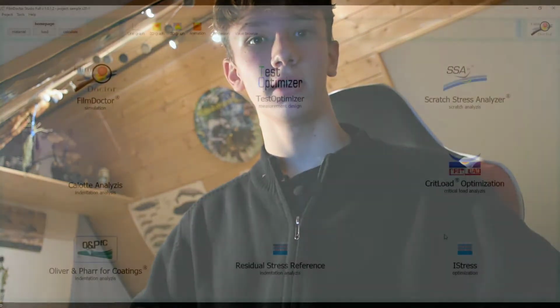Okay. Hello everybody and welcome to another video. Today I'm sitting in front of my laptop and I will show you how to use the OPfC, also called Oliver and Pharr for coatings, in the Filmdoctor studios. Now let's get right into it.